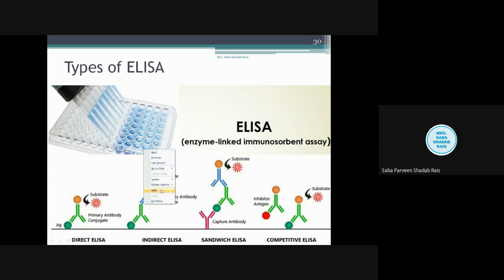I will take another slide here. Suppose this is, students, bear with my drawing, the anti-X antibody. Now I have inserted this anti-X antibody into the patient, sorry, into another animal, say a rat. This is the human antibody. Okay, this is the anti-X human antibody.